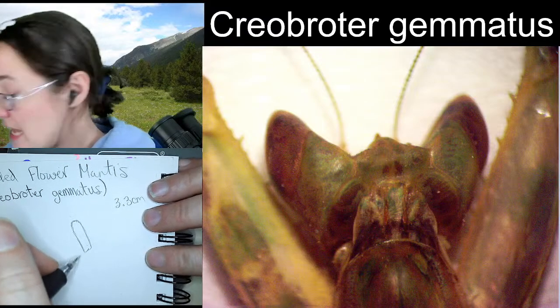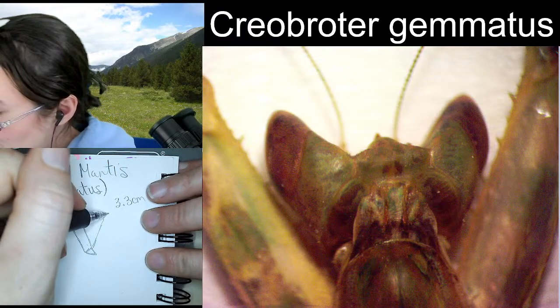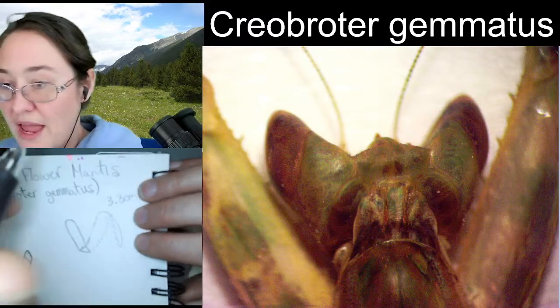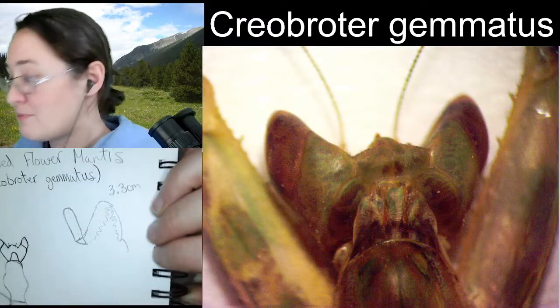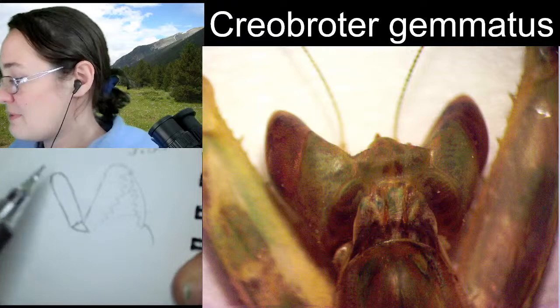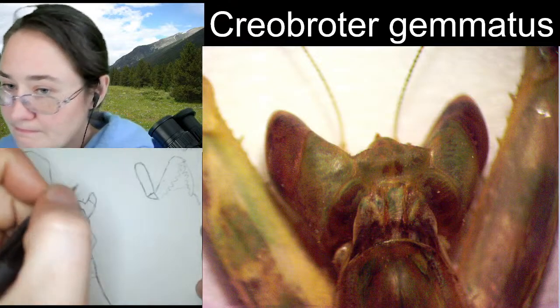The trochanter is like a little pizza shape. It's going to be right here on the corner. It creates that corner. It creates the elbow. Then this is the femur with all the spikes on the inside. The tibia spikes this way, and then the tarsal segments come off of that. So many people, when they're looking at a praying mantis leg, see this portion and forget the tarsal segments at the end. But that's going to be like looking at it from a side. Coxa, trochanter, femur, tibia, tarsi.